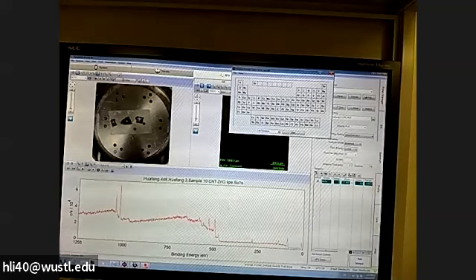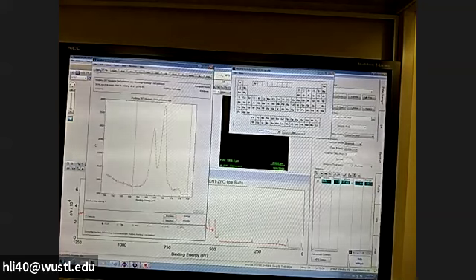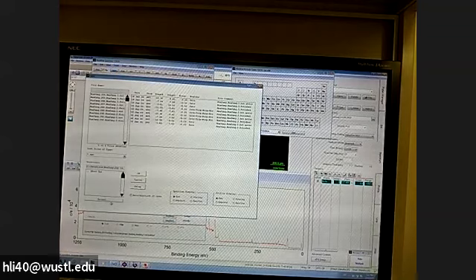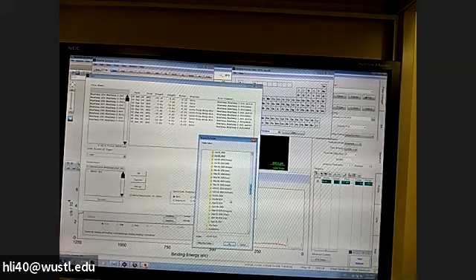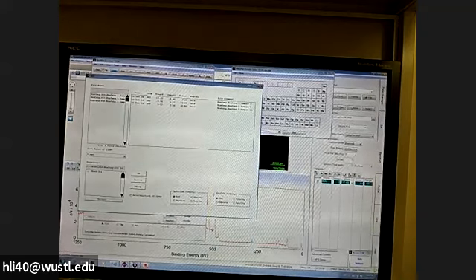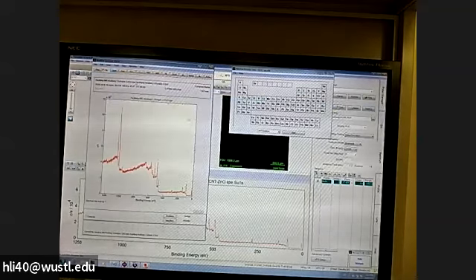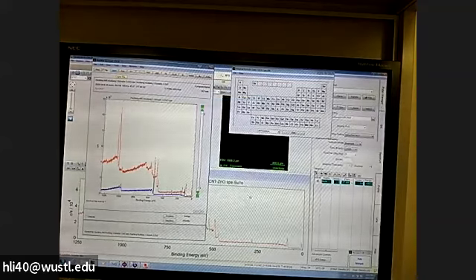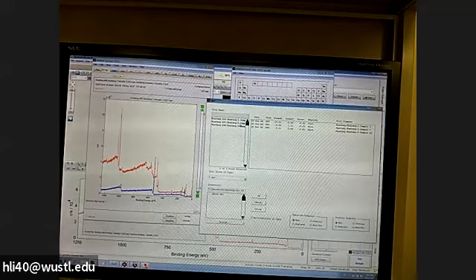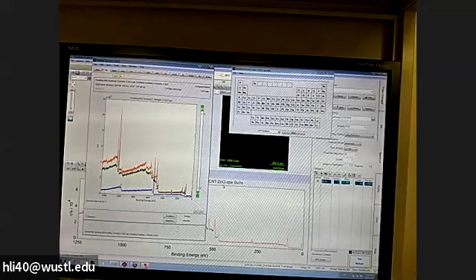All right, now this side is ready. We get all the spectra we want. If we go to my pack, we open the folder we set up. So it's still under my name. It's October 6th. All right, so we got 3 spectra there. We can open one. This looks like that. We open the second one. We can say overlay if you have similar samples, but if you have unrelated samples and you just want to take a look, you just click new. So these are the 3 spectra we see.